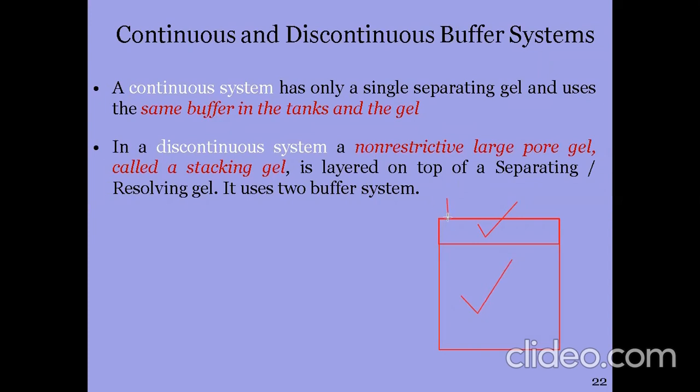We load the sample here in this gel, and this is more porous, meaning the pore size of the gel will be larger. What I am saying is that in a discontinuous system we have two parts of the gel.